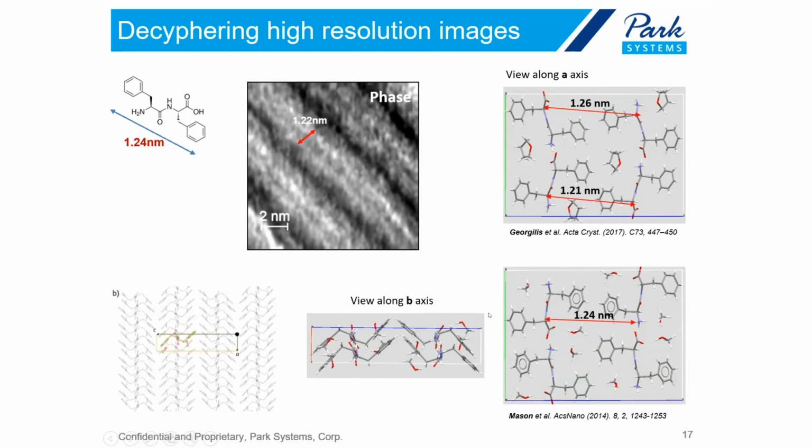But the critical thing here is that in X-ray diffraction techniques, you measure bulk, on many, many billions of molecules. In AFM, you do those measurements locally. So it's a highly localized measurement, where you receive that structural information from just, I don't know, tens or a couple of hundreds of molecules. And you can probe that structure locally, investigating some molecular defects and so on. So that's probably the first example of resolving molecular structure on that sort of complicated bioinspired peptide nanotube.